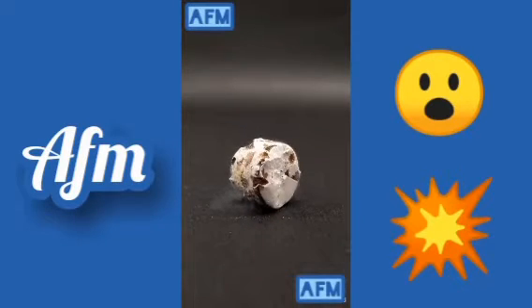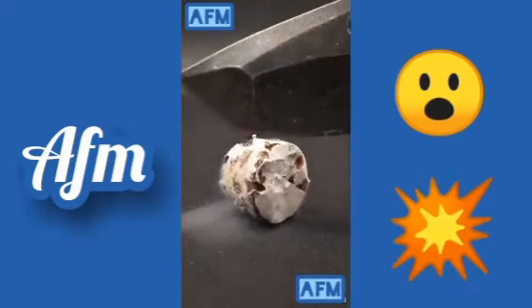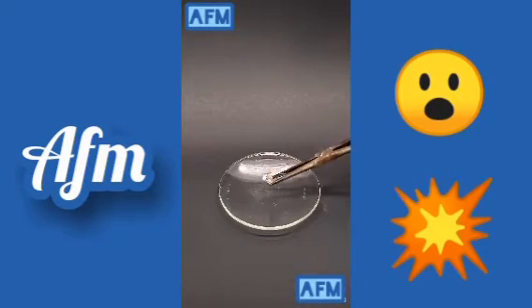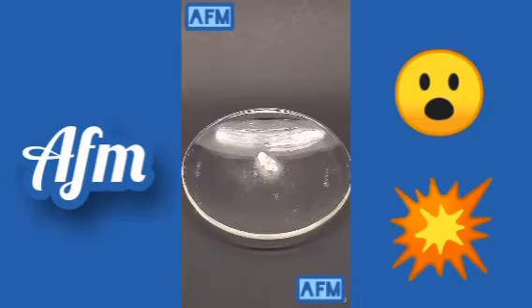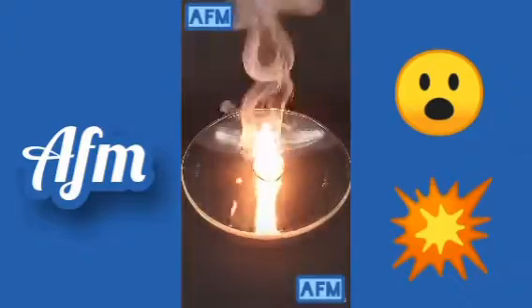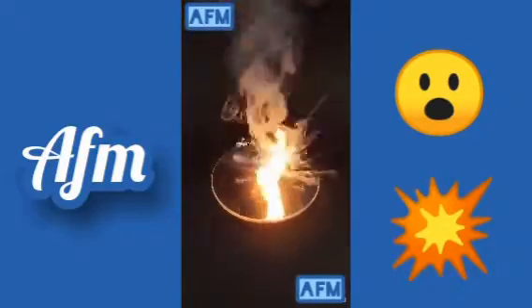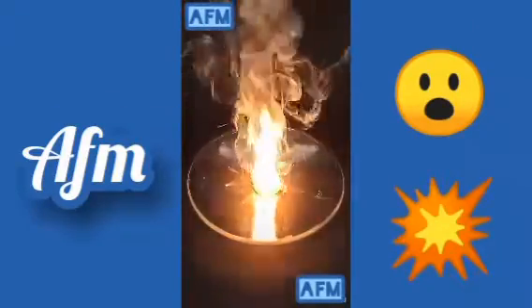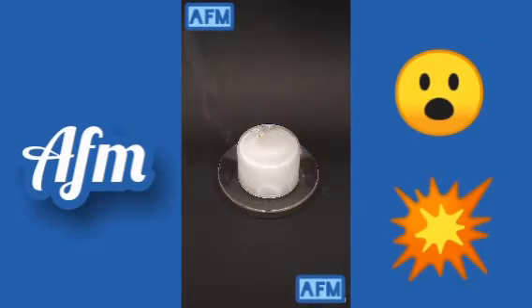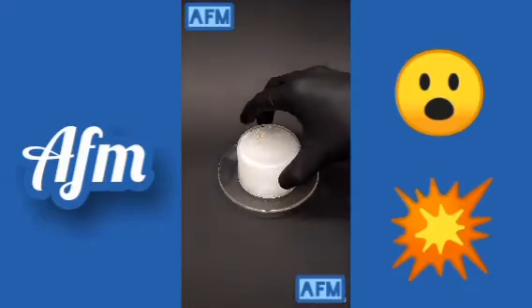It's often used to make large amounts of smoke, but it's also sometimes used as a weapon, which is a bit terrifying. This is because white phosphorus is not only very toxic, it's also super hard to put out when it's on fire. To test this, I'm just going to light this small piece. It immediately starts burning and splashing, but I can put it out by just smothering it, which makes it seem not that bad. However, because it's so reactive with air, this is what happens when I take away the dish.